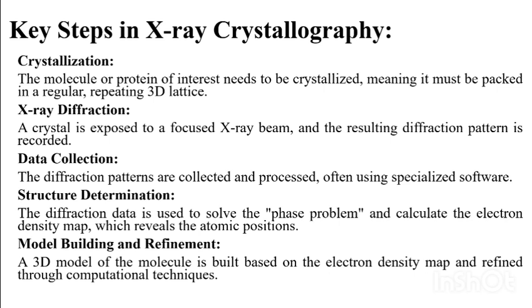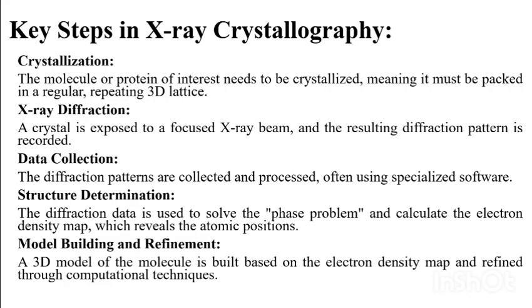A crystal is exposed to a focused X-ray beam and the resulting diffraction pattern is recorded. So a beam of X-rays is focused on the crystal.